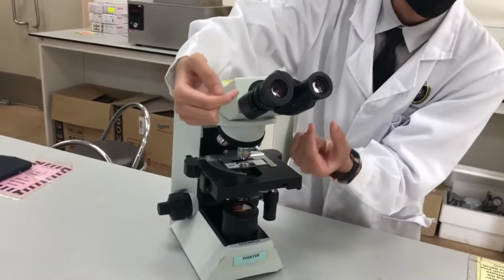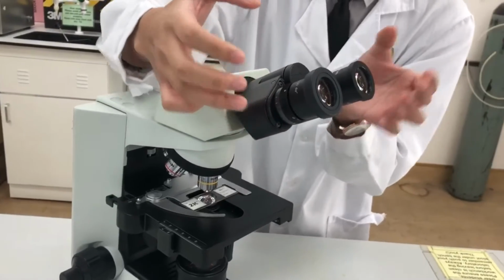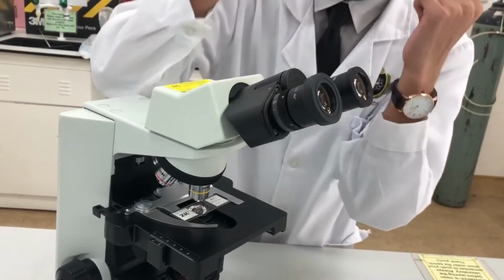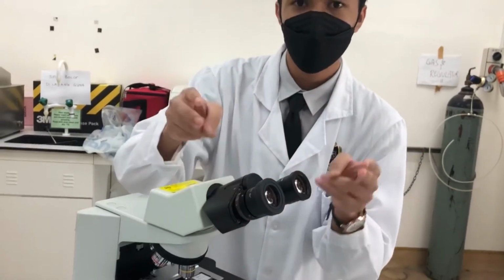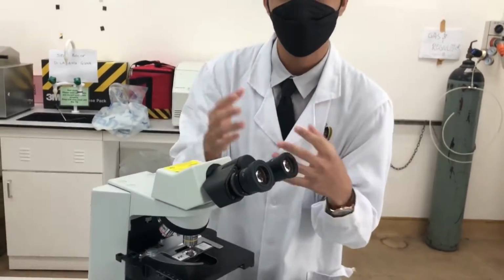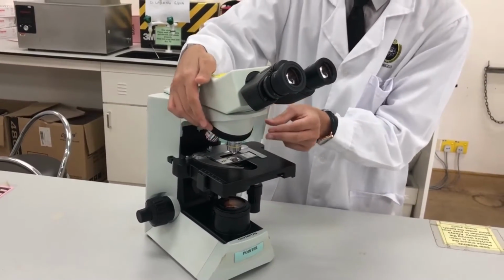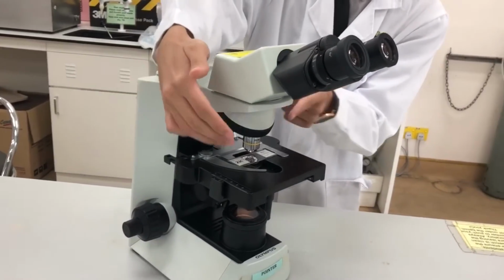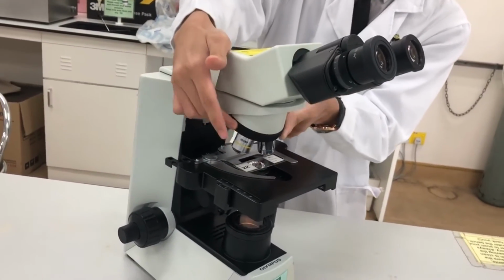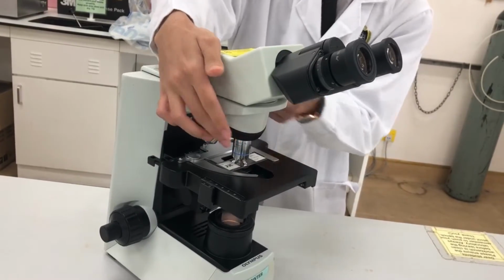So, moving on to the diopter adjustment. When you look through a microscope with two eyepiece lenses, you must be able to change the focus on one eyepiece to compensate for the different vision between your two eyes. So next is the nosepiece, also known as the revolving turret. It holds the objective lenses. It is movable, hence it can revolve the objective lenses depending on the magnification power of the lens.